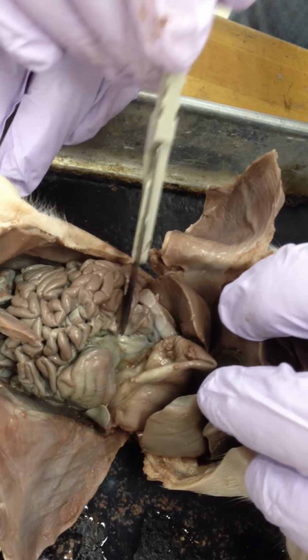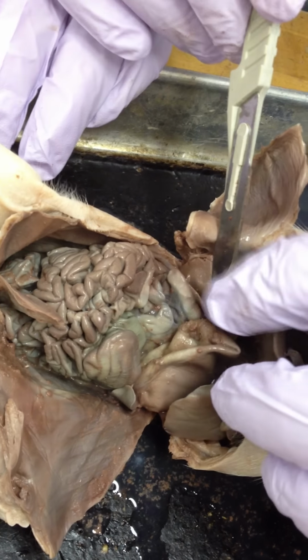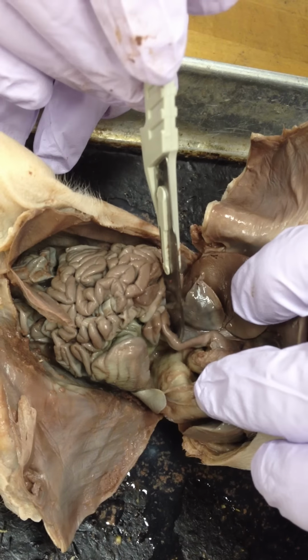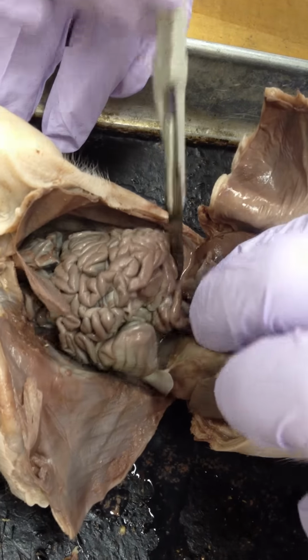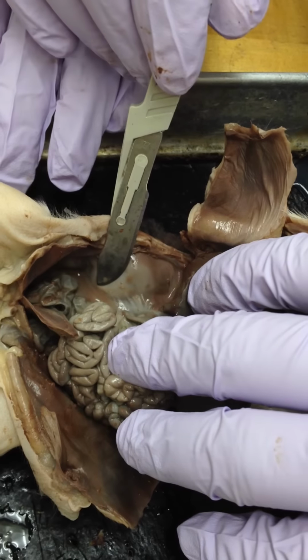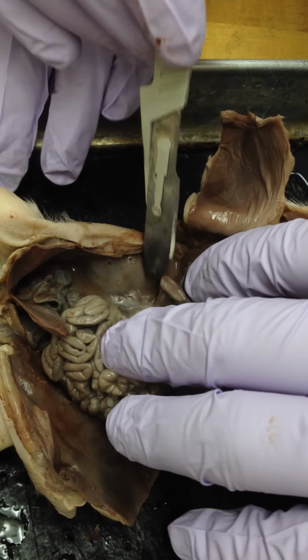Unfortunately, I think it's really hard on a pig to show where the pancreas is. Maybe the pancreas is like... let's see. There's the omenta. Those are like straps that wrap around the liver or the stomach. You really can't see that. So there's the mesenteries right here.